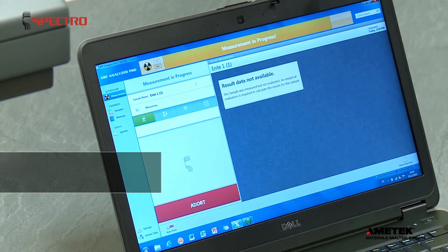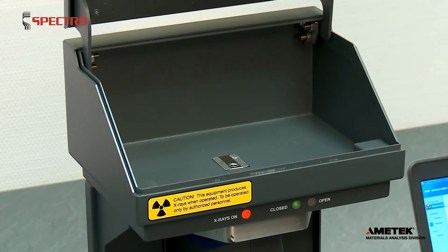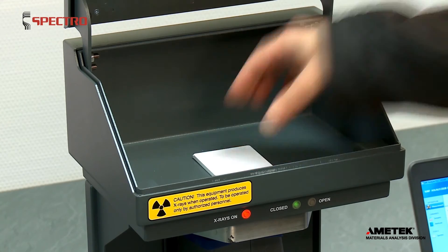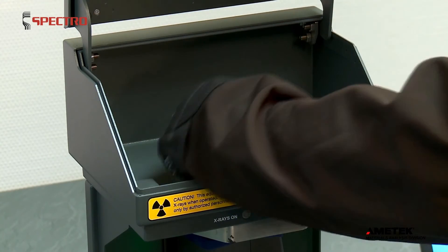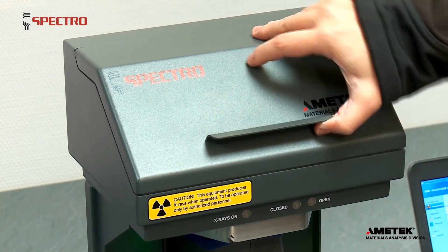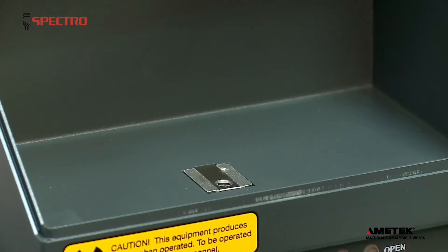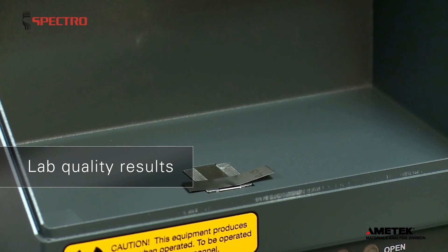XSort can provide metals or non-metals identification in seconds. Innovative technologies supply repeatable laboratory quality results, and simple displays plus ergonomic designs make this instrument extremely easy to use for almost anything you might want to analyze.